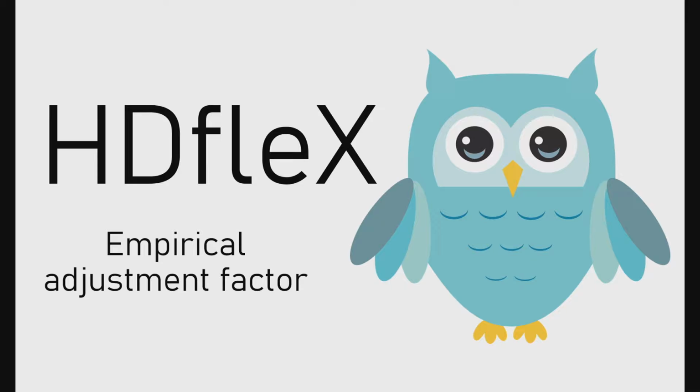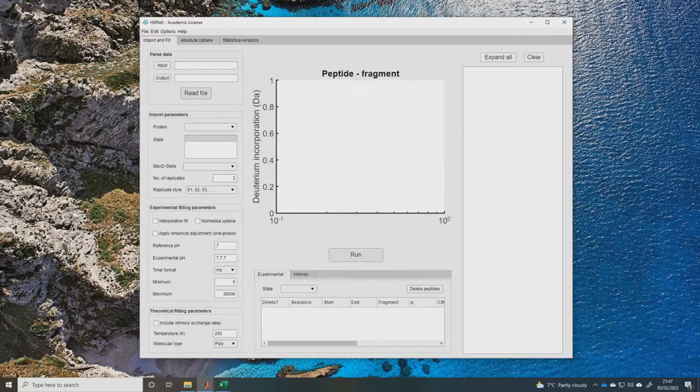In this tutorial, I will show you how to use the empirical adjustment factor when fitting data from different solution conditions that affect the intrinsic exchange rate. In order to perform the empirical adjustment, we first need to calculate the empirical adjustment factor from an experiment performed using the same buffers, but using an unstructured peptide such as bradykinin.